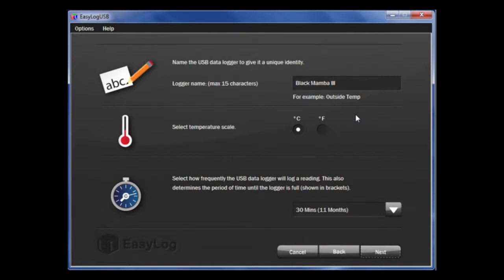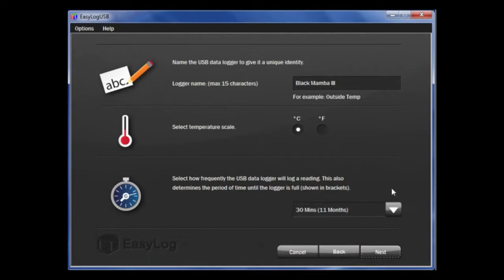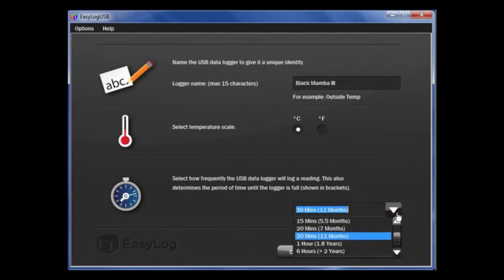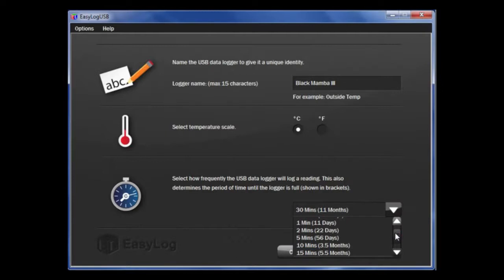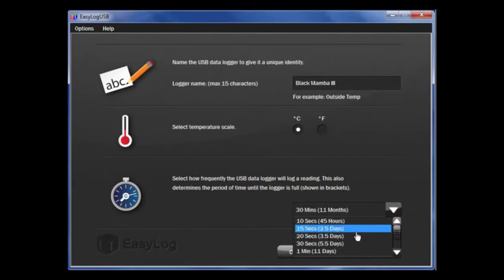Next, you can choose between degrees Celsius or Fahrenheit. Then, choose how often you want the logger to take a reading. You will note with these options in brackets, it shows how long it will take the data logger to fill up with data. Once that is complete, click Next.